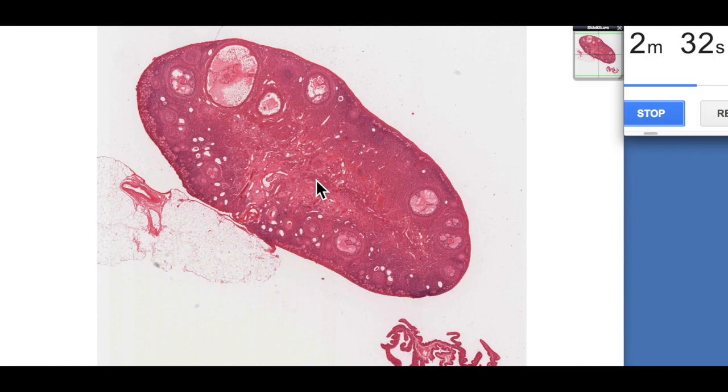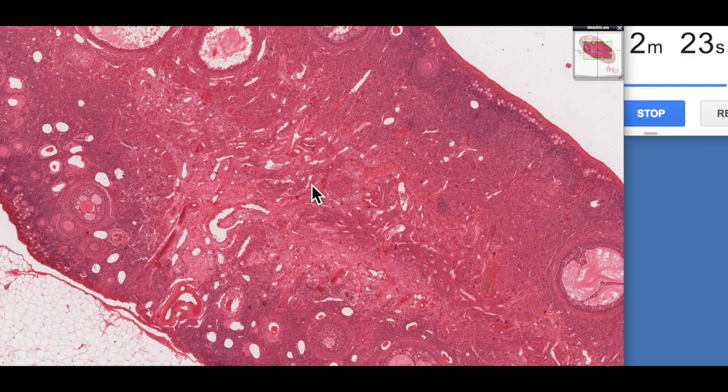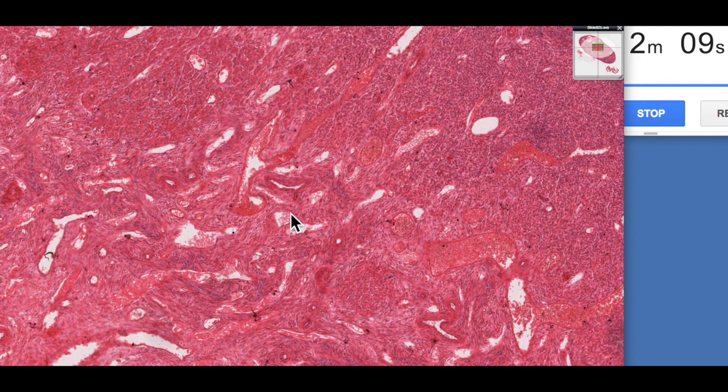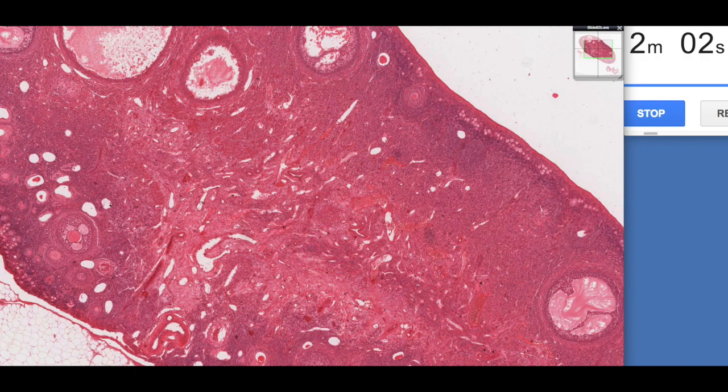The medulla is probably the least interesting region of the ovary, but probably most functionally important, because this is where the ovarian artery and veins run. The blood supply exists within this tissue here. The artery is often described as being helicine. You can see a little arteriole here. Helicine just means helix-shaped or spiral-shaped. It's made up of dense irregular connective tissue, and often the medulla is continuous with the ovarian ligament, which is the ligament which attaches the ovary to the lateral sides of the uterus.